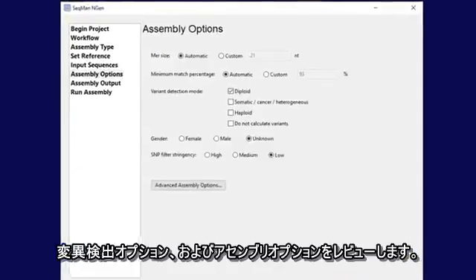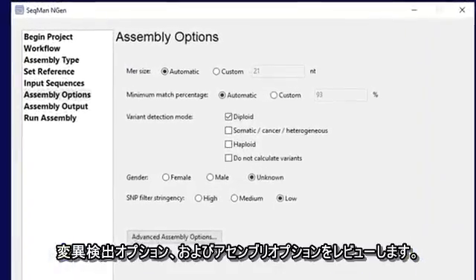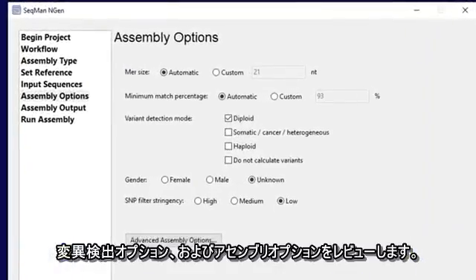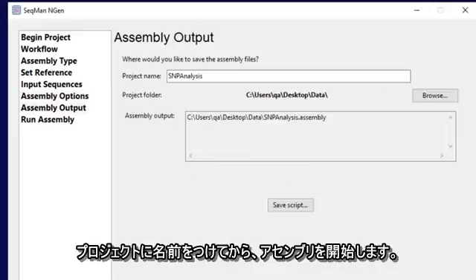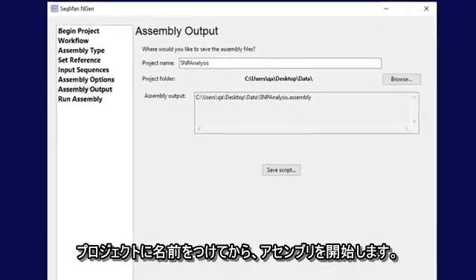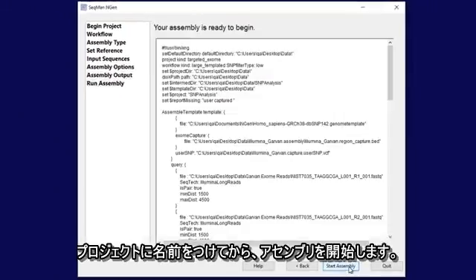Review variant detection options as well as assembly options. Name your project, and then start the assembly.